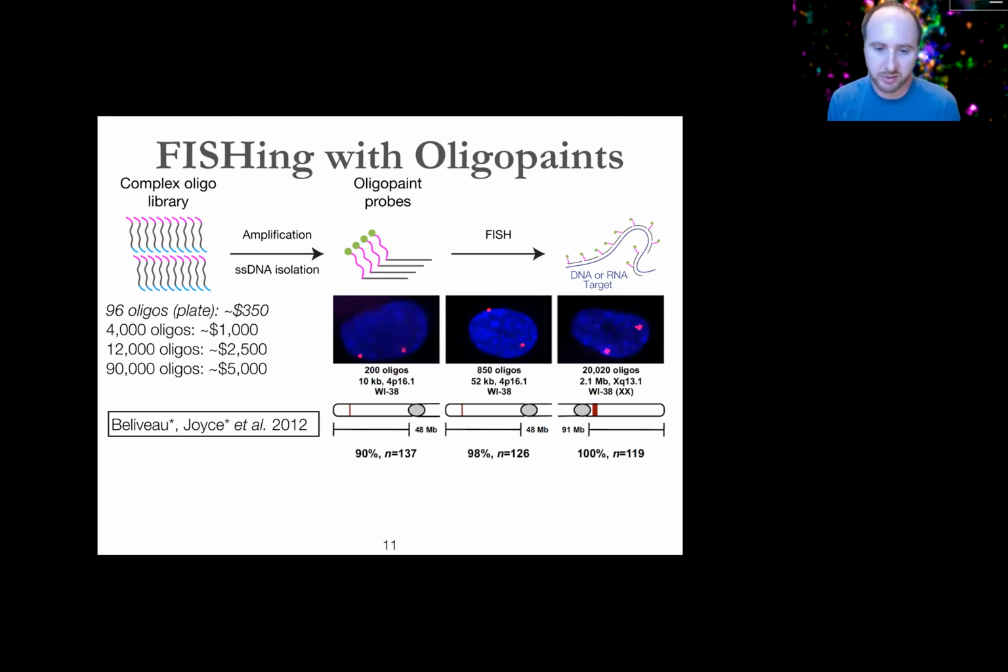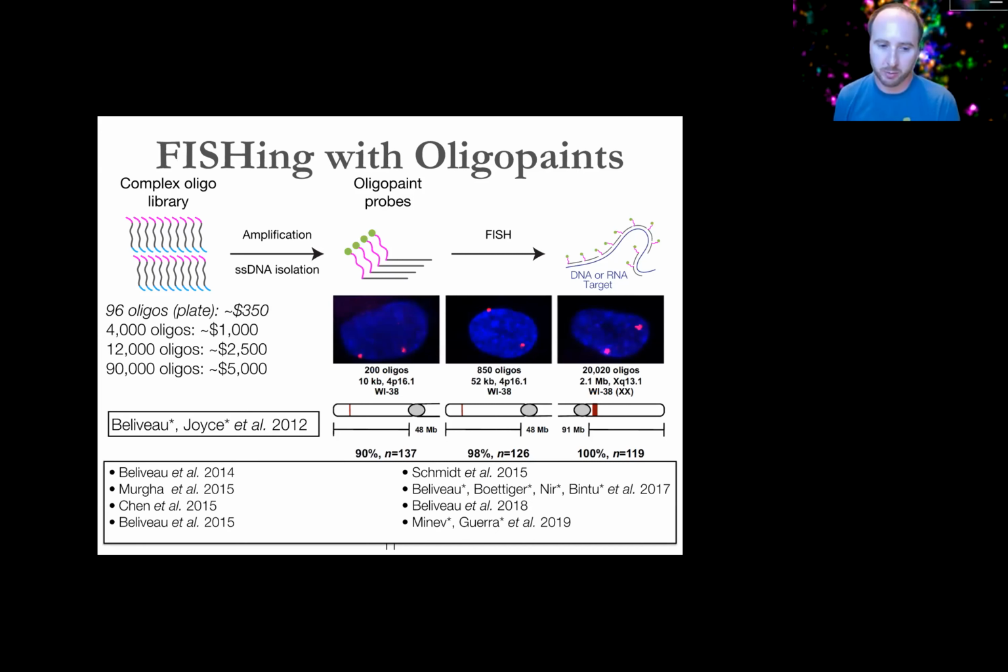So we can do things, for instance, like quantifying our efficiency of labeling chromosomal DNA at targets ranging from 10 kilobases up to multiple megabases. And we see generally on the order of 90% or more of cells displaying 1 or 2 foci, which is great. So that tells us that we're doing a very good job of interrogating the DNA that we're trying to target in our sample. And these data themselves are quite old. So we and others have made a lot of updates to the molecular biology and FISH protocols aspect of this. So I think right now it's fair to say that this is a pretty workhorse and routine technique that's being used by a lot of groups.